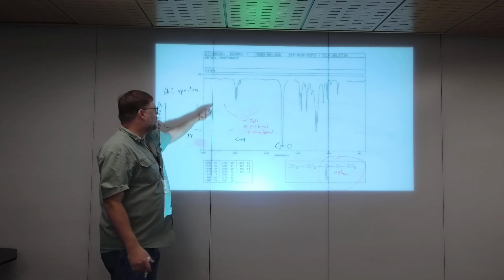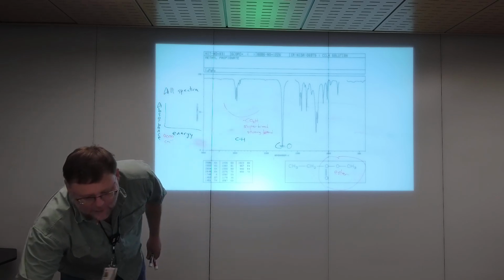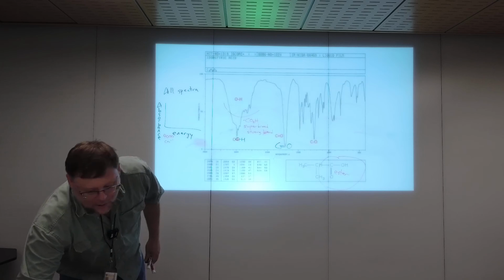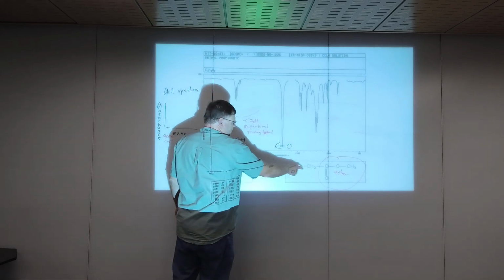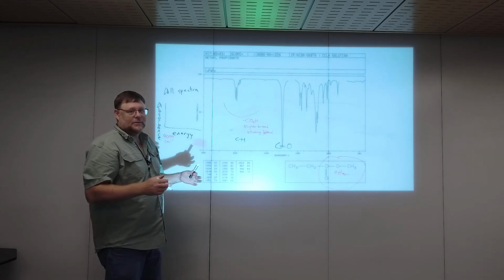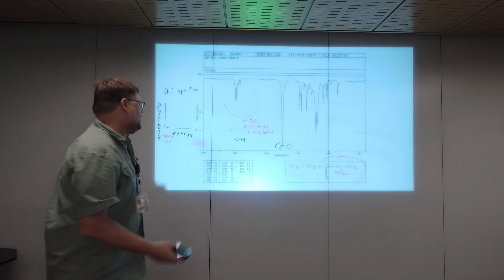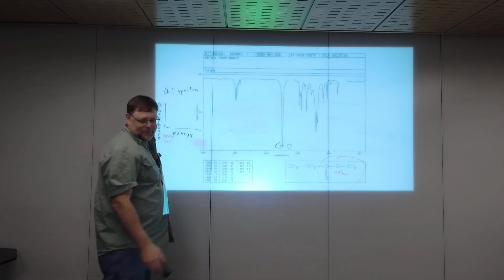We don't have any OH. See, if you go back, watch the spectrum. Go back. You got an OH. The OH goes away. The carbonyl in the ester stays basically in the same spot. Big strong peak right in the middle. That's a carbonyl. If you don't remember any IR besides that, you'll be all right. I shouldn't say you'll be all right, but you'll know something.